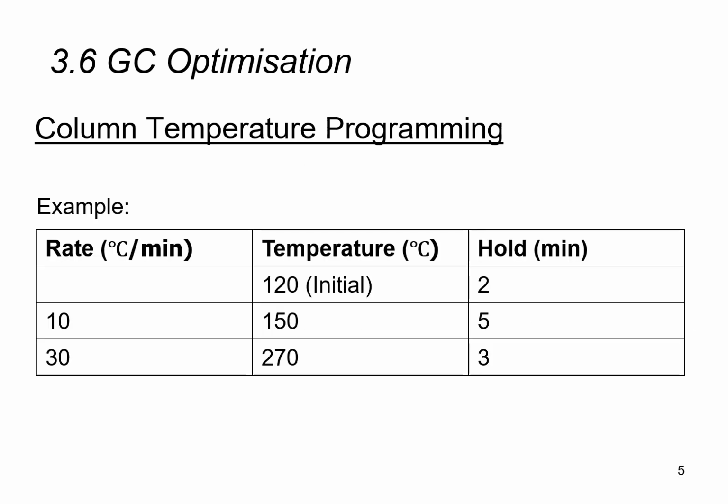retained. So this is an example of a temperature programming sequence, whereby we may start off the instrument at 120 degrees Celsius, which is considered quite low, and we can keep it there for 2 minutes. This allows 2 minutes of time for the lowly retained compounds to interact with the stationary phase.